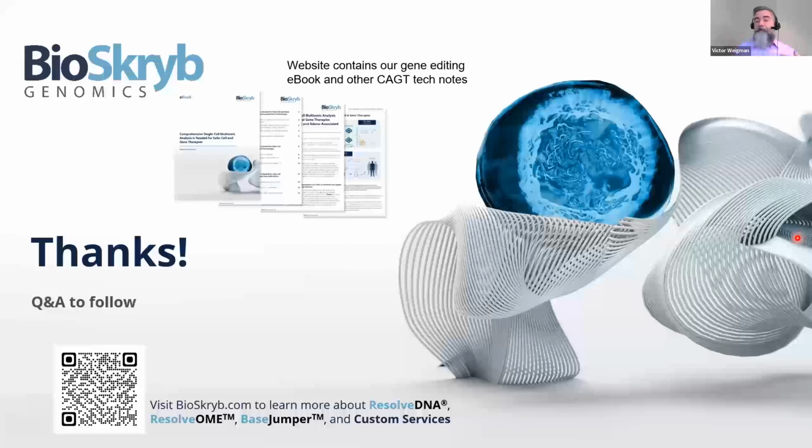But again, that's a straight lookup. As algorithms get more and more sophisticated, understanding the processing, the temperatures, and the context specifics, like alleles in a certain order changing things, are going to impact a lot of these things. So again, the improvements, just like the guides, the molecular improvement is there. I think these algorithms are getting a lot better. I'm certainly eager to use them. But again, for this, we saw several hundred that Cas-OFFinder was identifying with that seven base pair flexibility.